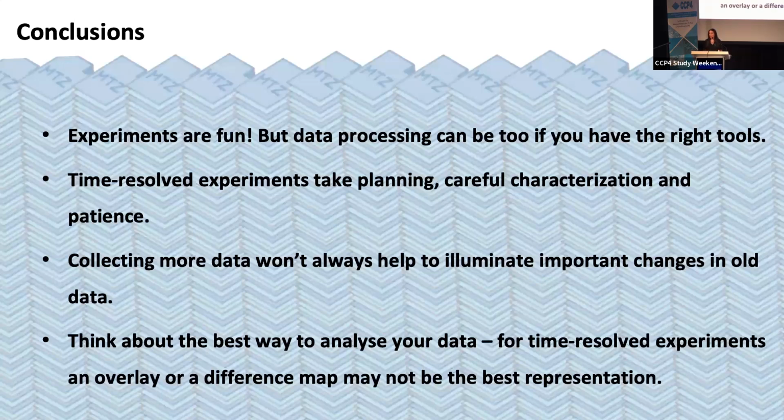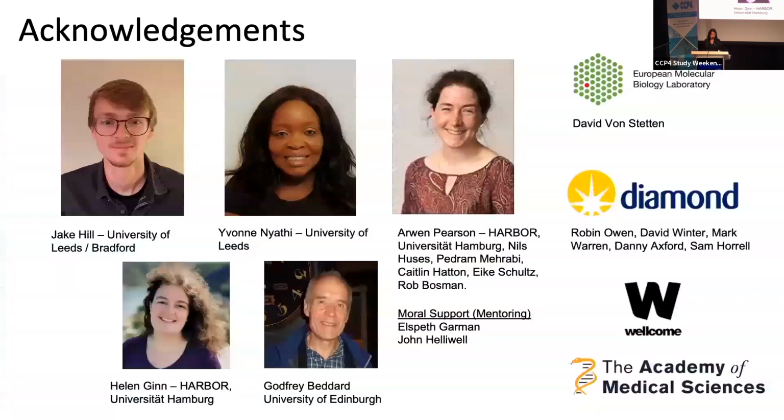Sometimes we do have to go back through and have a good look at our old data and think about the best ways to analyze your data. So for time-resolved experiments, a difference map, an overlay isn't always going to tell you the full story, as has been repeated multiple times during this meeting. It's important to have a look at different ways that you can analyze your data.